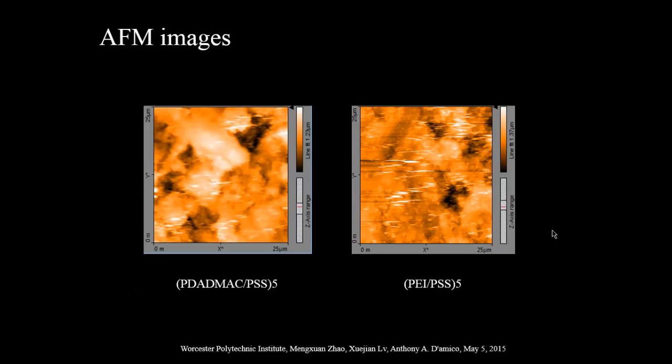These are AFM images of two polyelectrolyte multilayers on the substrate. There is no big difference between these two images. This is because the thickness of the multilayer coating is around only 10 nanometers, so the surface morphology is mainly dependent on the substrate.